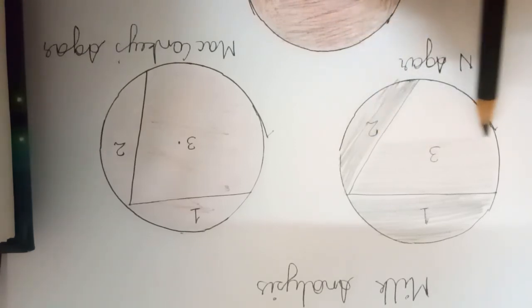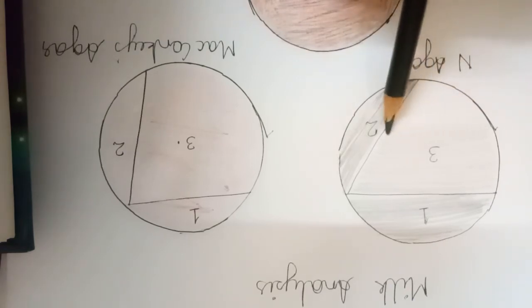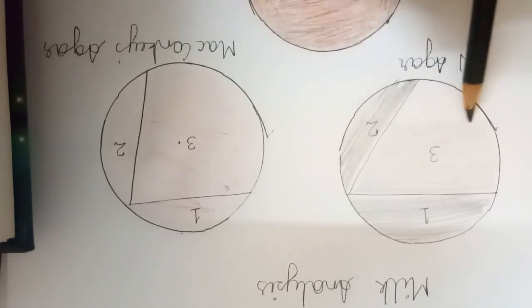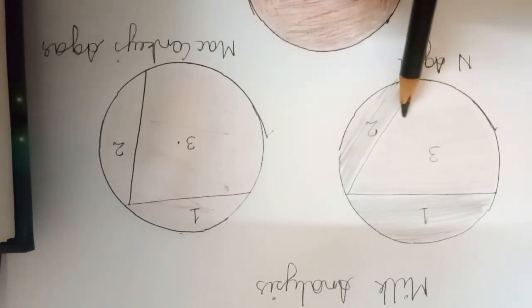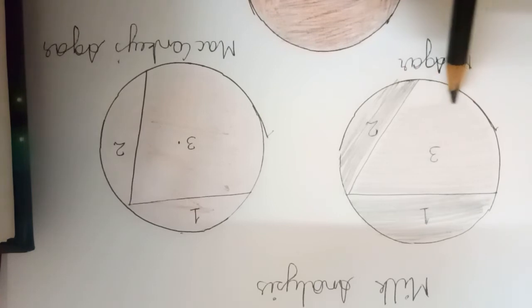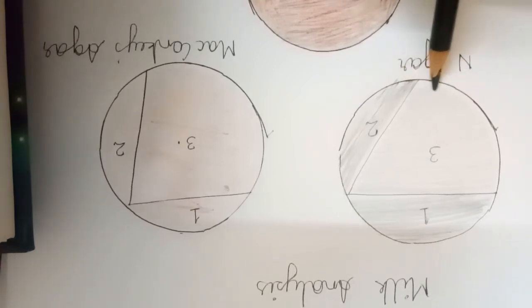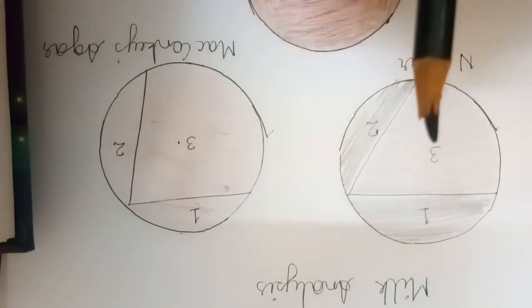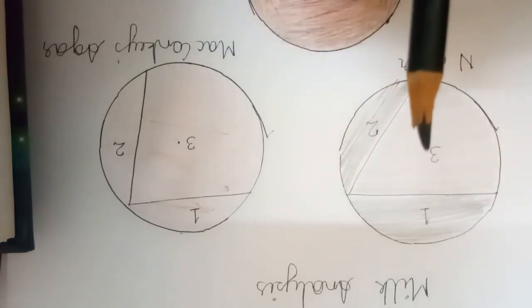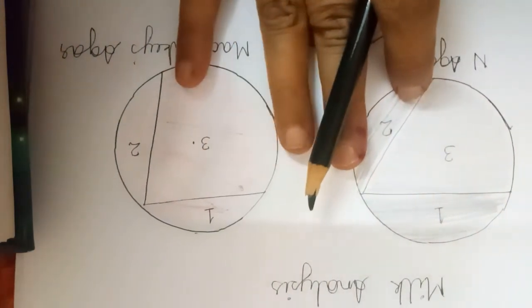If you make very close sectors or very close streaks, it will give you more good isolation of colonies of bacteria. You are able to dilute it out very nicely when you make the very close streaks. So our agar plate has already been inoculated. Now we will go for McConkey's agar inoculation.